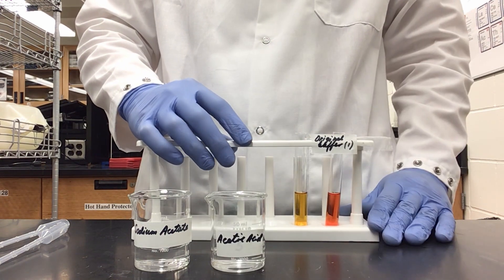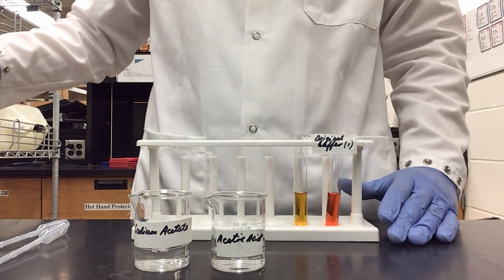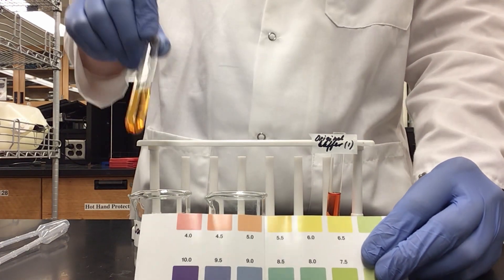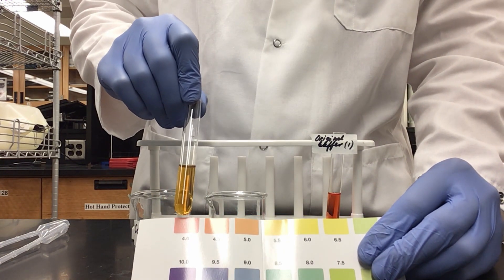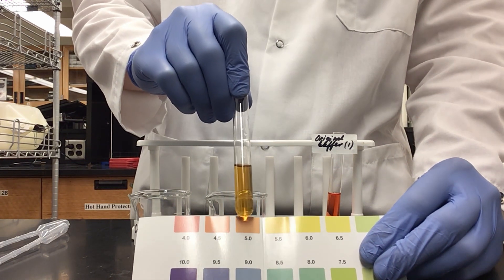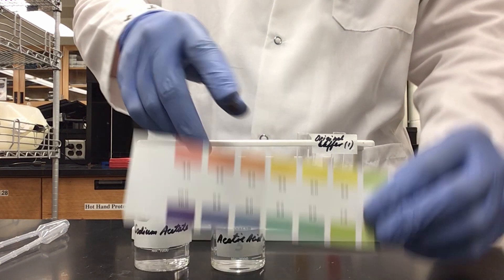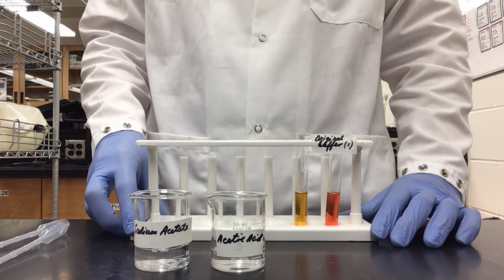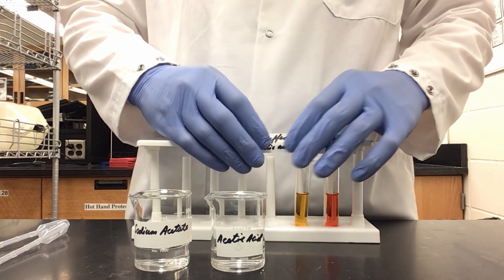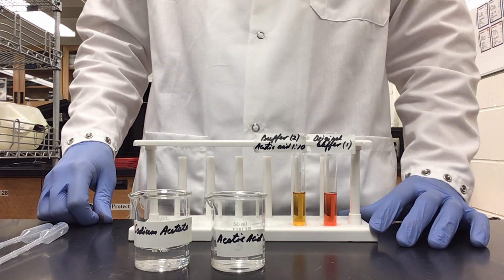Comparing my two solutions side by side, you can see that my diluted solution is a lighter color of orange. The original was between pH 4 and 4.5, but our new one is sitting between 5 and 5.5 based on its orange hue. We have increased the pH by about a factor of 1, which is what we would expect. Diluting the acid by a factor of 10 causes the pH to increase to a more basic level by a factor of 1.